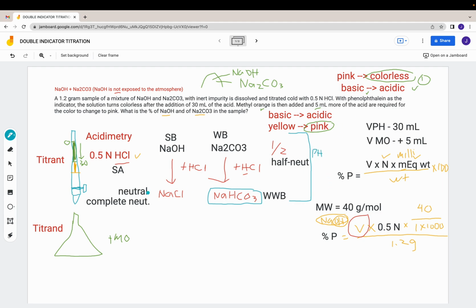And here, you can see your phenolphthalein from pink, it becomes colorless. Remember, from a basic salt, it becomes less basic upon addition of acid. So in short, from basic, it becomes less basic, therefore towards acidic pH. And that's why here, you're seeing a change from pink to colorless.